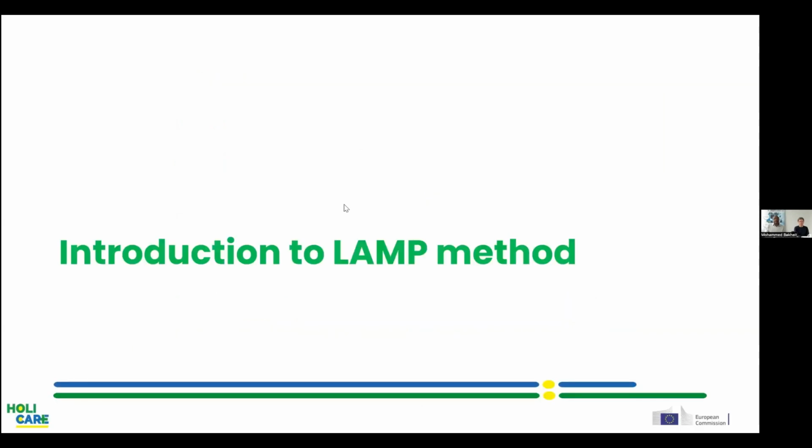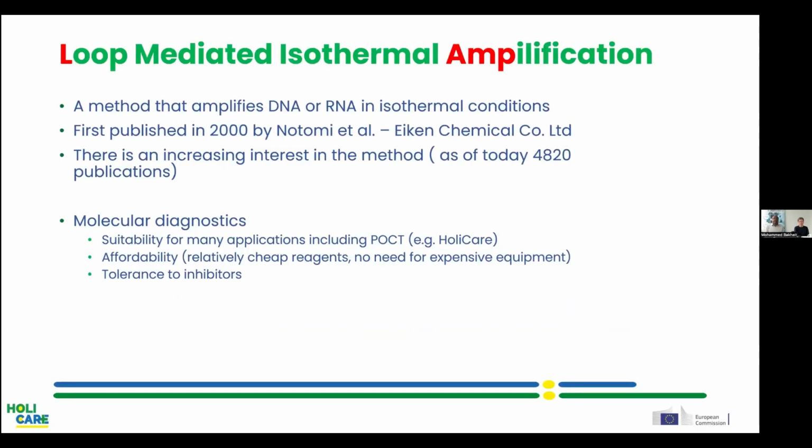So to start with the introduction part, loop-mediated isothermal amplification, which we also know as LAMP. The word comes from the first letters, these red letters, and the AMP is for amplification, a method for the isothermal amplification of DNA and RNA. It's a molecular diagnostic method, and it was first published in 2000 by Notomi et al., who was working and is still working for the company Eiken Chemical in Japan. There has been increasing interest in the method over the years, and I've just checked this today.